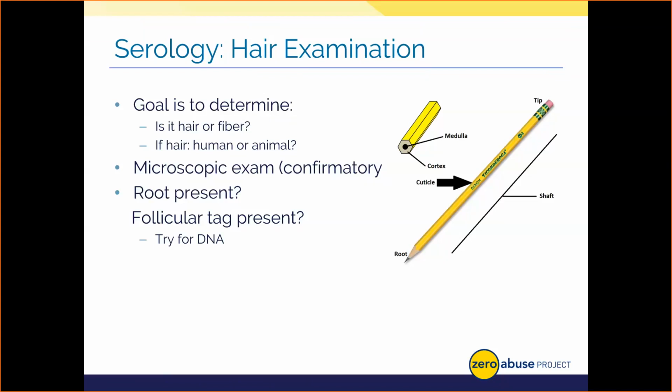Now, I can't tell you who a hair came from unless I get DNA. DNA can come from a couple of places right now. If we have a root with enough DNA, we might be able to pull a profile. If we get a follicular or skin tag, we could get a profile. There is some work out there in the research where people are digesting whole human hair and creating a DNA profile from the fragmented pieces of DNA in the hair shaft itself. But again, that's something for another discussion.